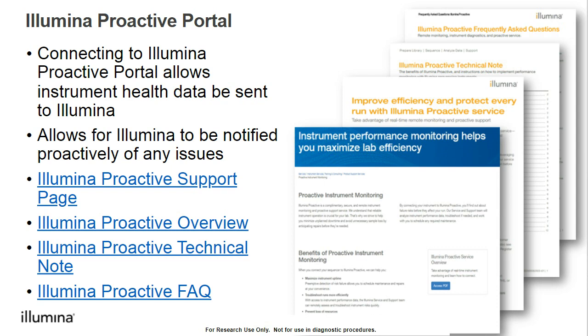We also have a plugin with MyIllumina, if you have a MyIllumina account, that allows you to review the historical trends of that iSeq 100, so you can see how the instrument has been running and been used in the past, which is really helpful as well. And it really just helps efficiently perform some troubleshooting steps instead of myself or one of my other colleagues asking you to collect run metrics and send them over to us. We can just review them on the spot. And we can also use some of that instrument hardware metrics to try to catch issues before they actually arrive.